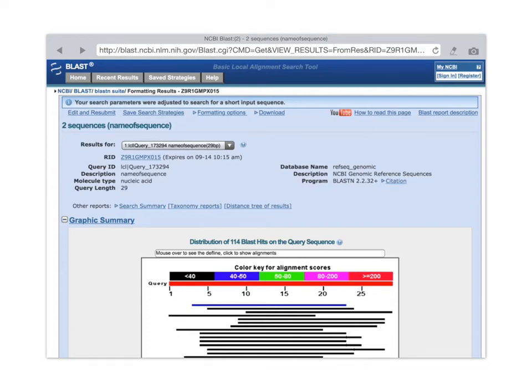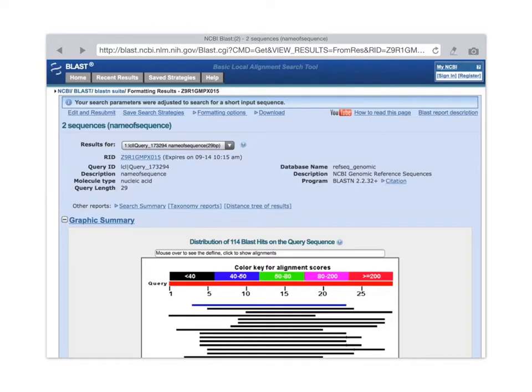And here is what a BLAST results page looks like. So first, at the top, we've got a drop-down menu where we can look at the results for each of our query sequences, that is, each of the FASTA sequences that we entered. So if I click on that, we'll see that we have our two query sequences.